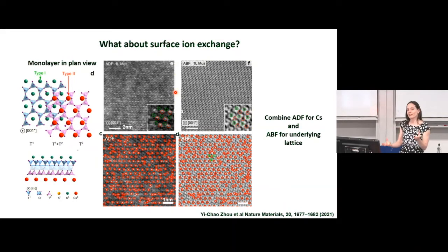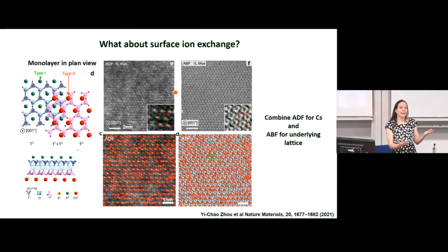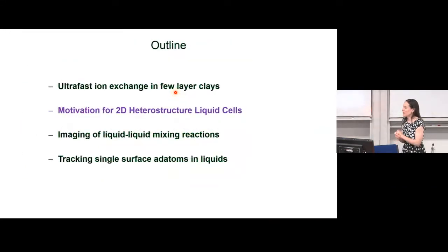One of the great strengths of electron microscopy compared to bulk techniques like X-ray analysis is that we can actually look down at individual atoms and see what they're doing, as opposed to studying an ensemble of thousands and thousands of atoms.